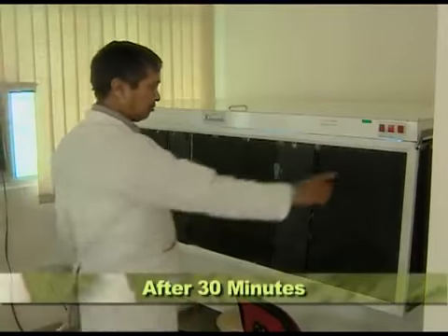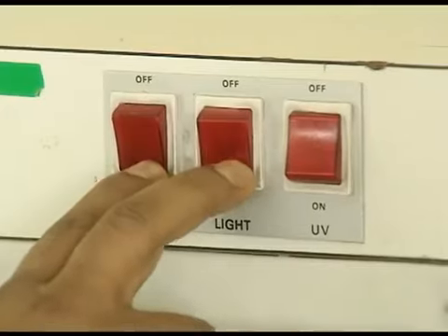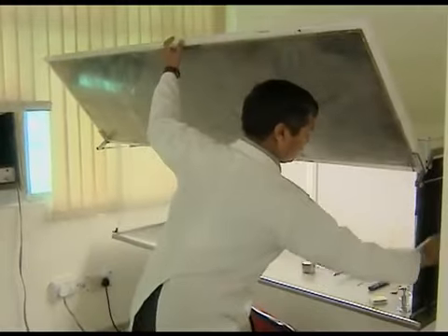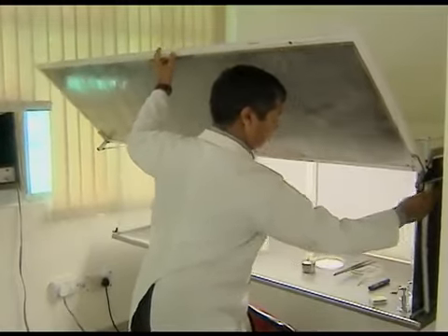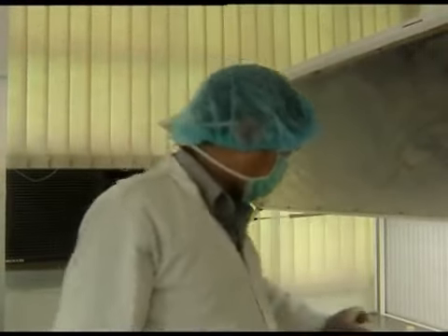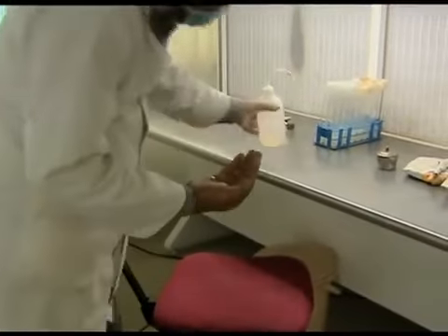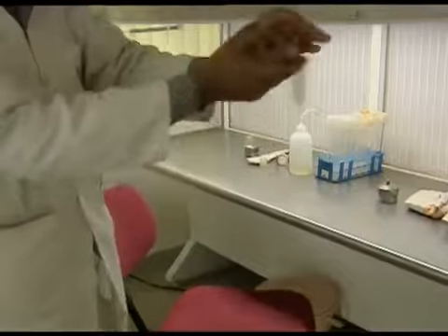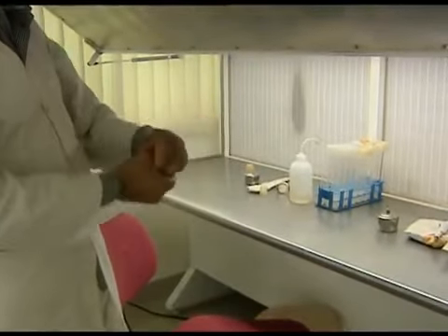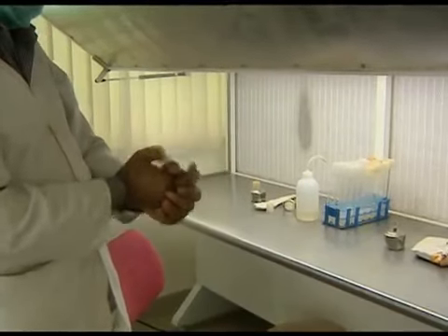After 30 minutes, switch off the UV light, switch on the chamber lights, open the shutter, and then switch on the airflow. Prior to operating the laminar hood, it is essential to wear a clean and sterile face mask and a cap. The panel of the laminar hood that faces us has a high efficiency particulate air filter.